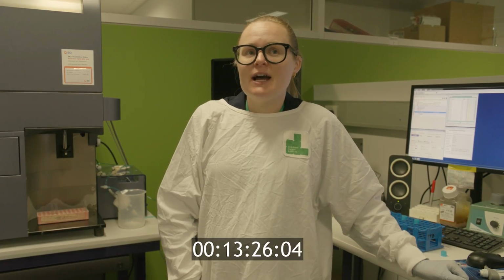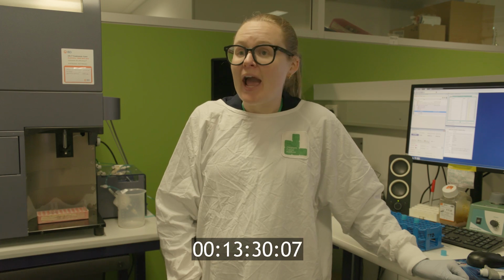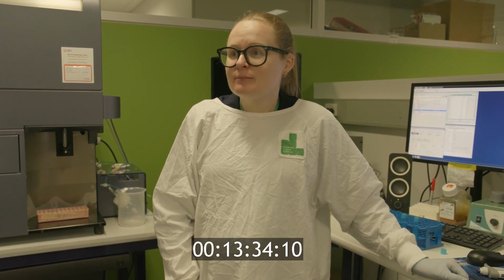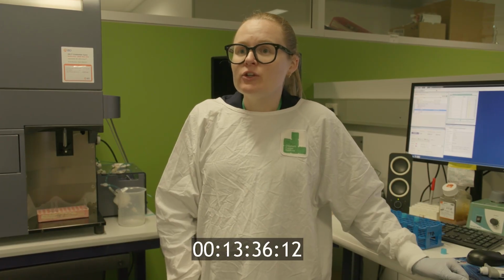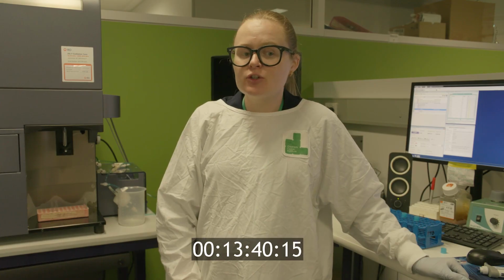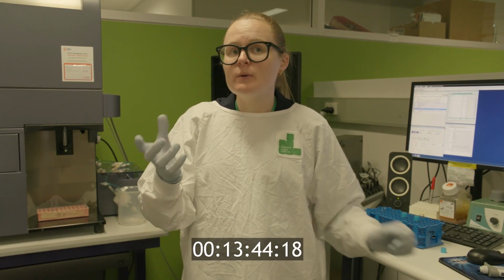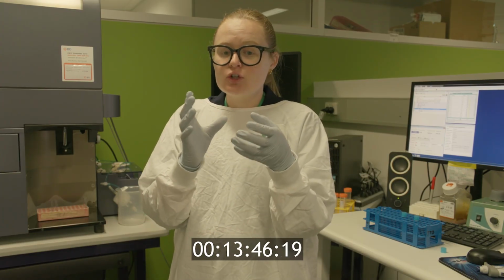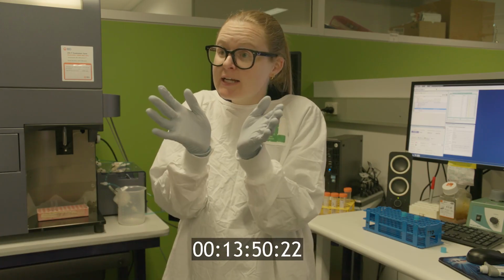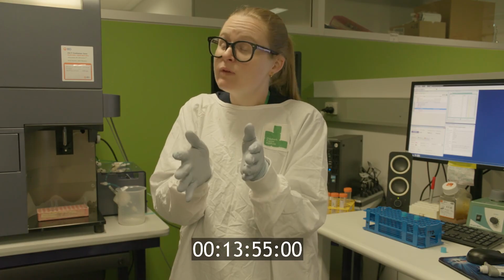Absolutely. I think it's how we can adapt it, how we can tailor it now. We used to only use it for deleting genes, pretty much. And now we can use it for so many other applications. We can use it to, as I said, introduce single point mutations. We can use it to introduce partial gene deletions, so rather than deleting the entire gene, we can just delete a small region.